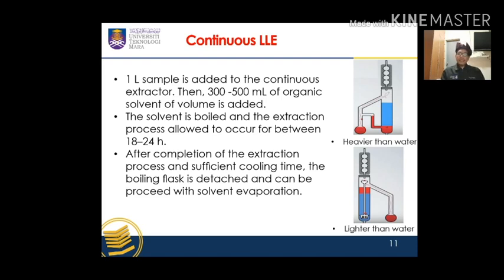After completing the extraction process and sufficient cooling time, the boiling flask is detached and solvent evaporation can be conducted before analysis. I will provide you a very interesting animation I took from YouTube. I hope it helps you understand more regarding these two methods, heavier than water solvent and lighter than water solvent.